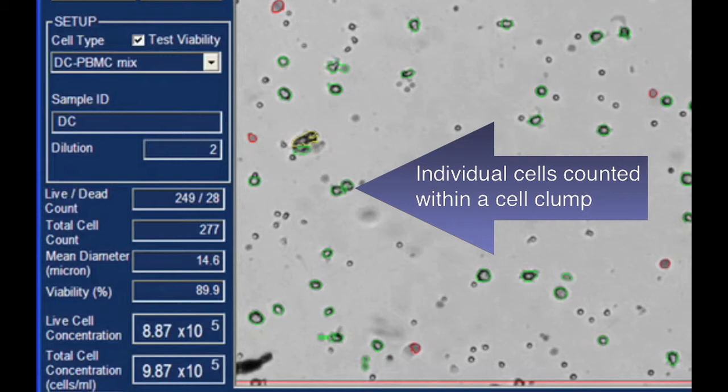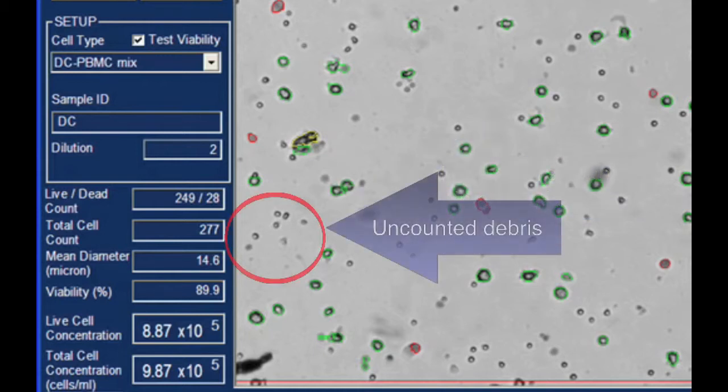Counted images can be used to clearly indicate uncounted cellular debris and proper counting of irregular shaped cells.